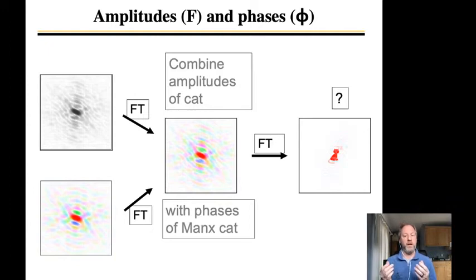That's the only way I can say it. This is why transition metal X-ray crystallography is easier than just doing hydrocarbons. If you've got an iron atom or a titanium, there's a lot of electron density there. You can totally model that; the brightest atom is going to be your heavy metal. And then you put that in as your model, and then the next atom out will begin to resolve itself.